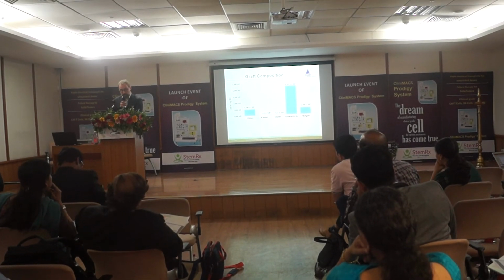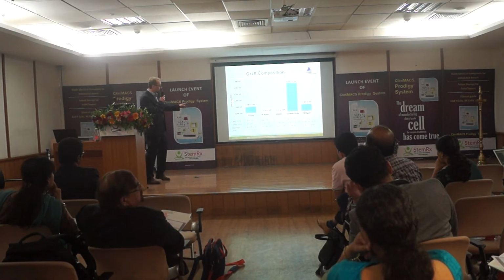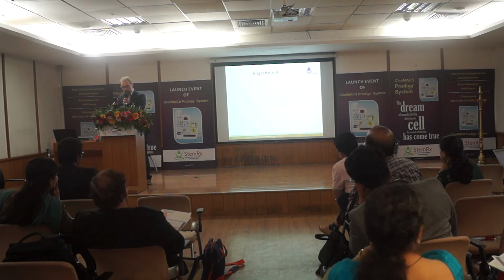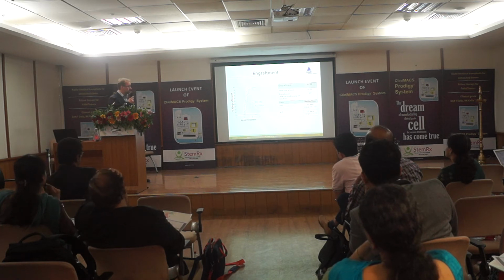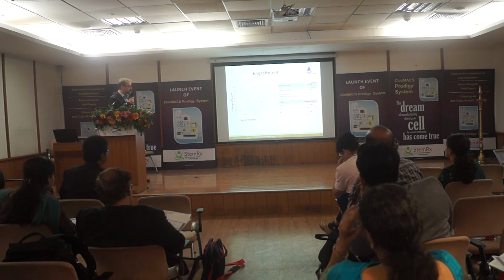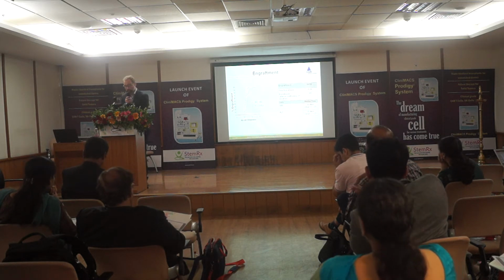So it was quite a successful graft we found here. I'm not going through all the data, just to confirm: we have seen this also in different papers, that the outcome of the graft composition looks really quite nice in our scenario. Then the engraftment rate. We talked about the quick engraftment, and we could confirm that quite well. For the neutrophils we have a median time of 12 days, for the platelets 15 days, and of course, as I said, due to the ATG we have a final engraftment of 29 of 30 patients.